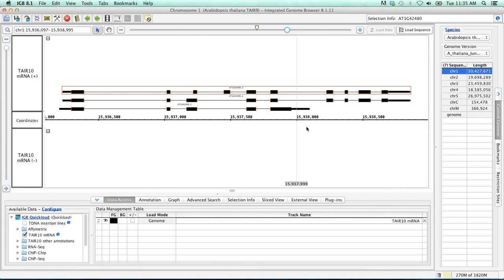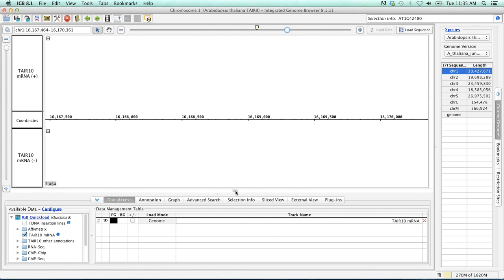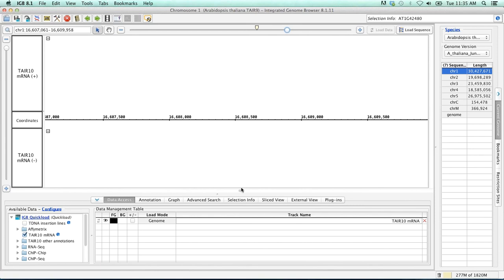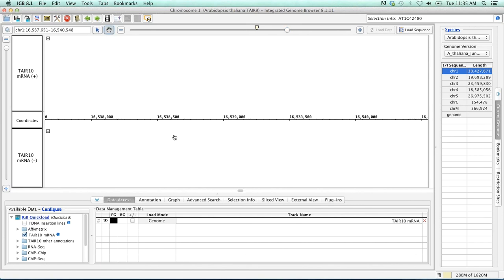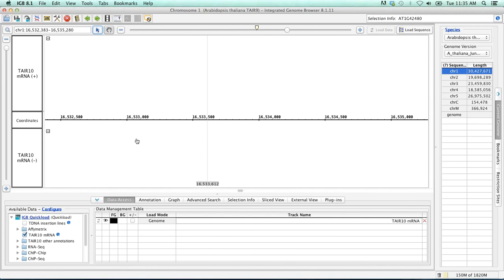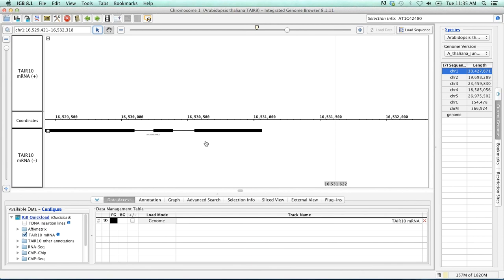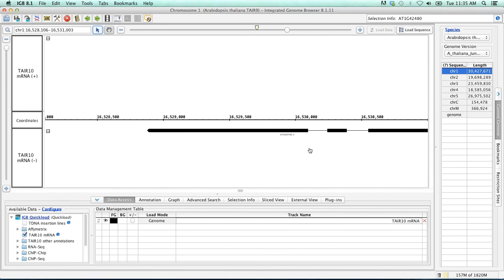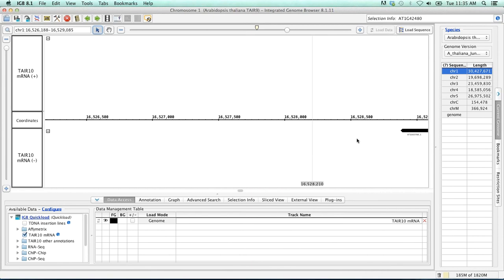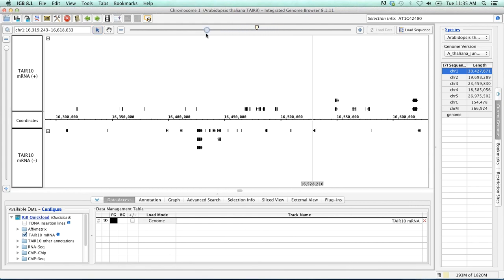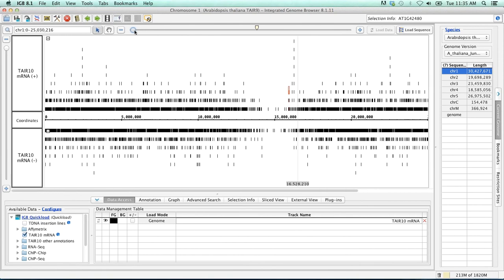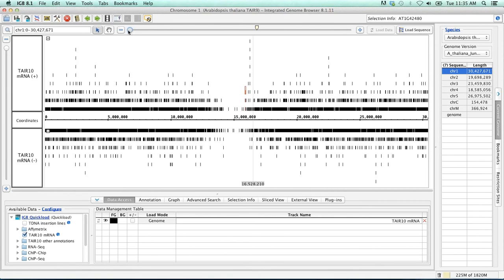For moving horizontally, we can use the slider at the bottom of this viewer. This will move us along at a relatively quick pace. In addition, you can also switch to the grab tool and simply drag yourself along. Or my favorite, which is just to hold the option or alt key, which will automatically switch you to the grab function. So I have to zoom back out. As you'll notice, we have very smooth zooming in IGBE. This is something we're very proud of and works very well.